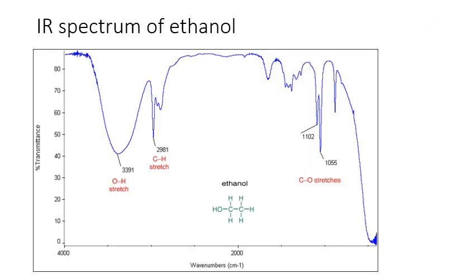So this is the infrared spectrum of ethanol.